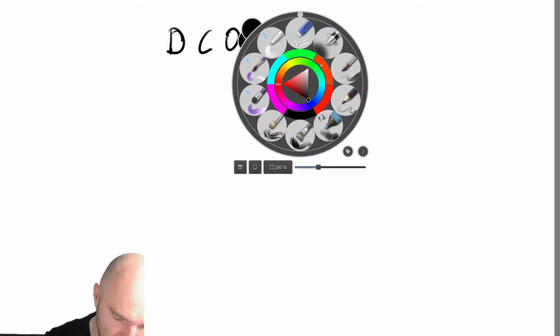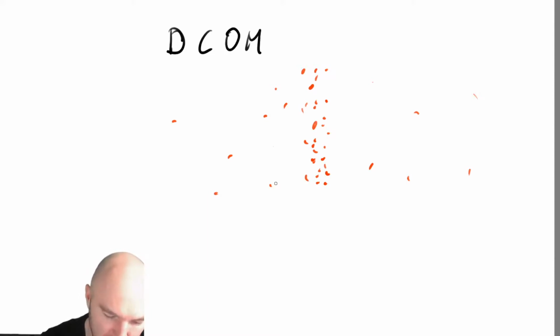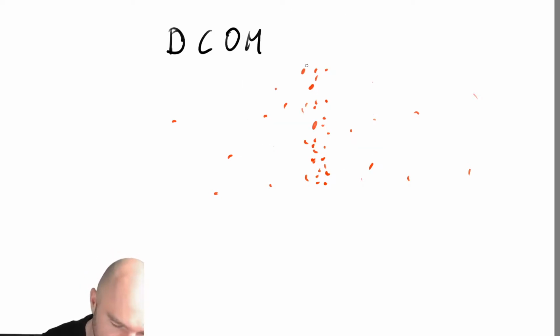So let's say you've got atomic positions. So your atoms are sitting, like your segregated atoms are sitting here. You might have a couple of stray atoms everywhere, but you have your grain boundary or your interface, and you've got segregated atoms to there. Obviously, isosurface is not a particularly good choice because you get little chunks everywhere. But we might already have our grain boundary as we have it here, and its outline is kind of right. Let's just say it's a little bit off.